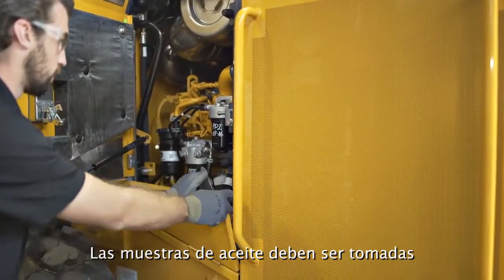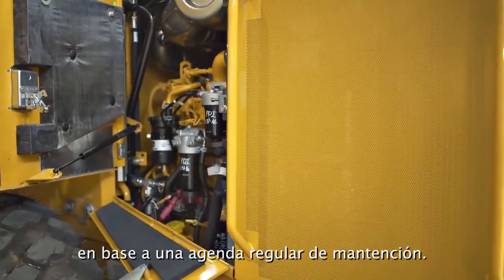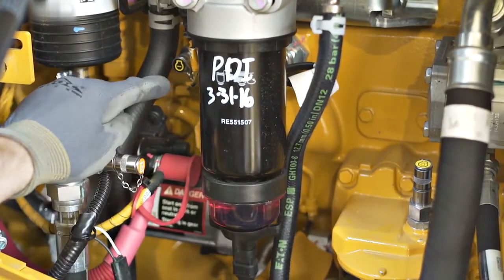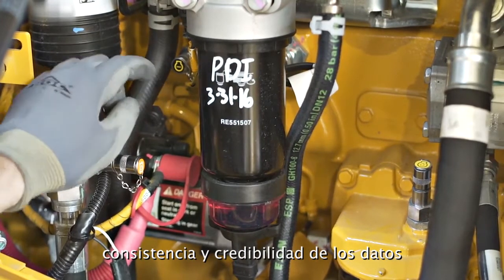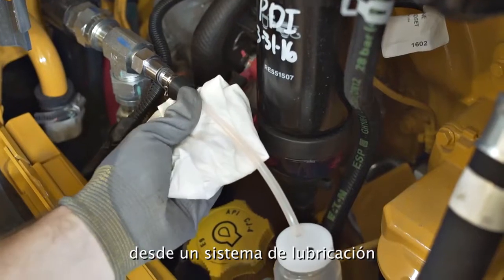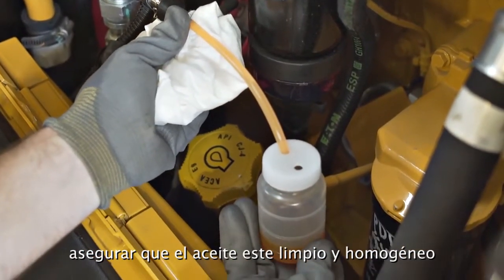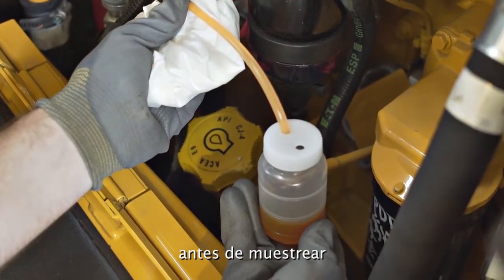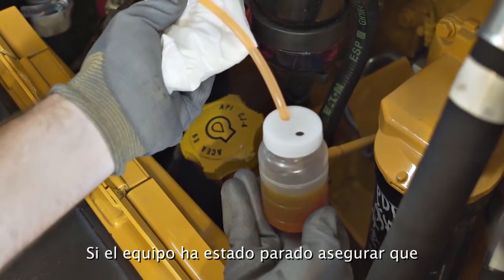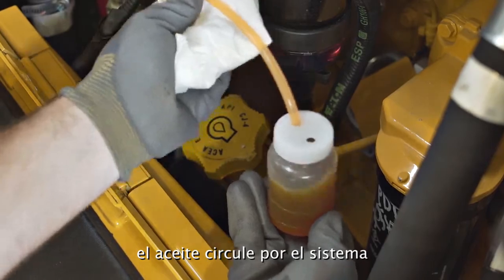Oil samples must be taken on a regular maintenance schedule. Sampling must be performed in a consistent location and manner. Good sampling procedures ensure consistency and reliability of data. When obtaining a sample from a lubricating system, always have the oil warm and thoroughly mixed before sampling. If equipment has been idle, cycle functions so that the fluid is agitated throughout the system.